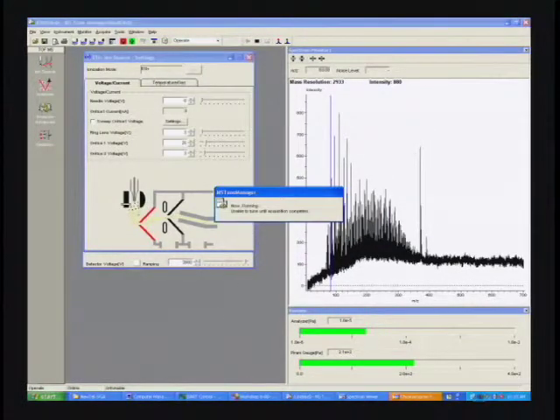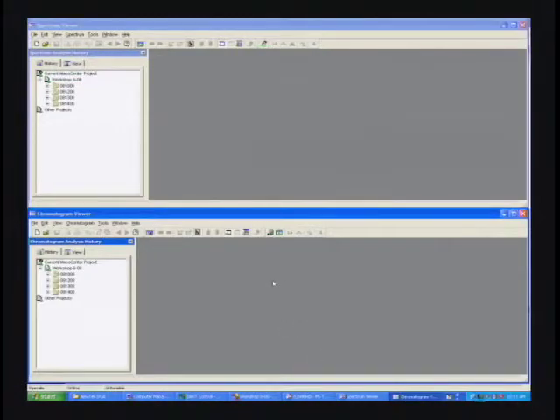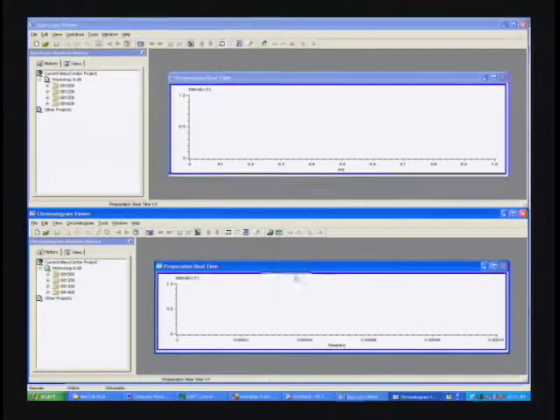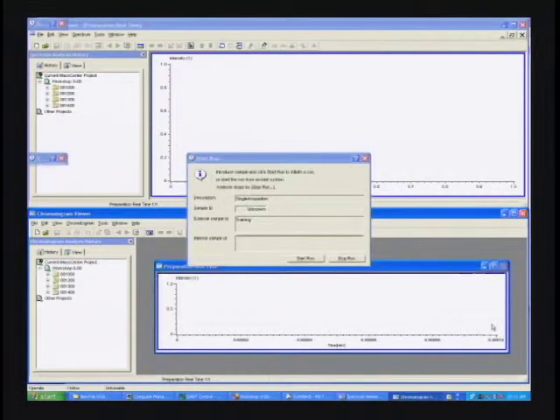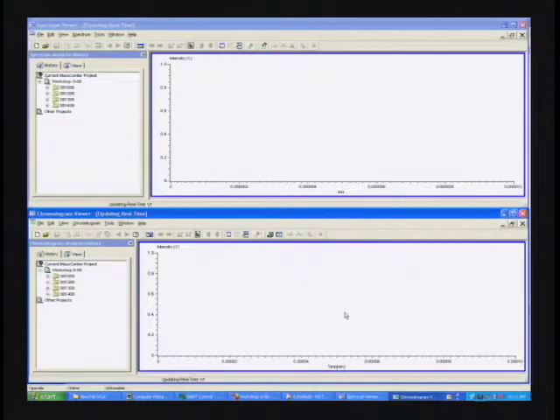The program will open up a data file, and we'll wait for the Start button to appear. As soon as the Start button appears, we can begin collecting data. Now, once I hit the Start button, I'm going to reach over and grab the tablet with some forceps and hold it in front of the DART. And then I'm going to wave some reference compounds, some polyethylene glycol 600, in front of the DART. So here's our Start button. We'll let it run for just a second or two to collect some background.